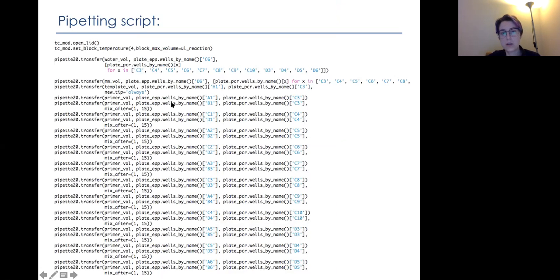And so this is a script. Maybe if there's someone from you in programming is gonna laugh at my script because it's very elementary. So it's just saying in the end to transfer the liquid, all the liquid transfers one by one. Now I'm probably able to do this a bit better, but it uses this command transfer, and then it says to mix after. So it's just how you would pipette, put in another place and transfer.